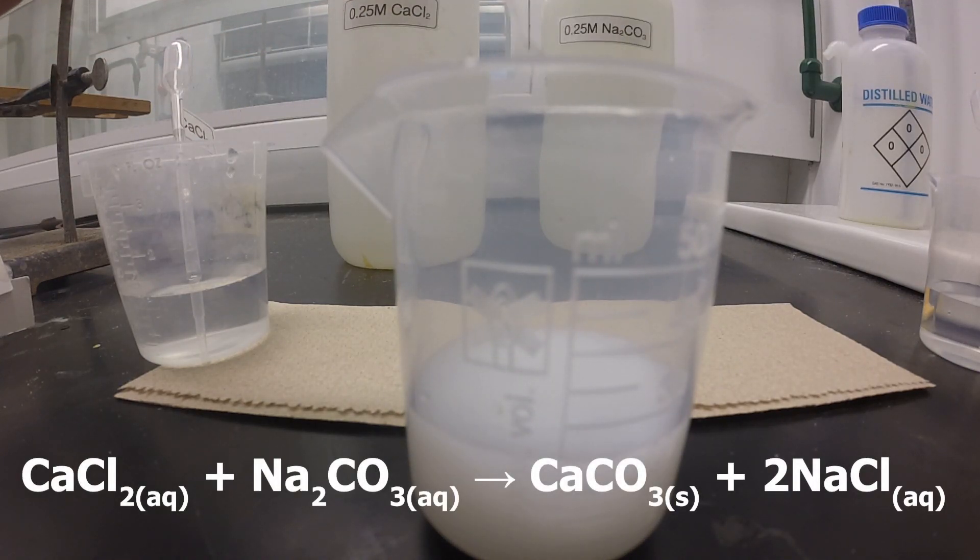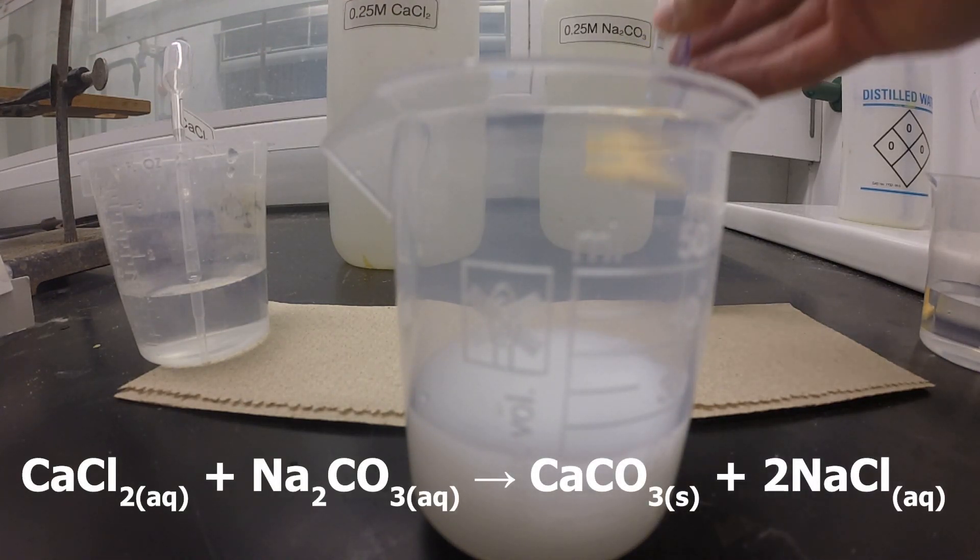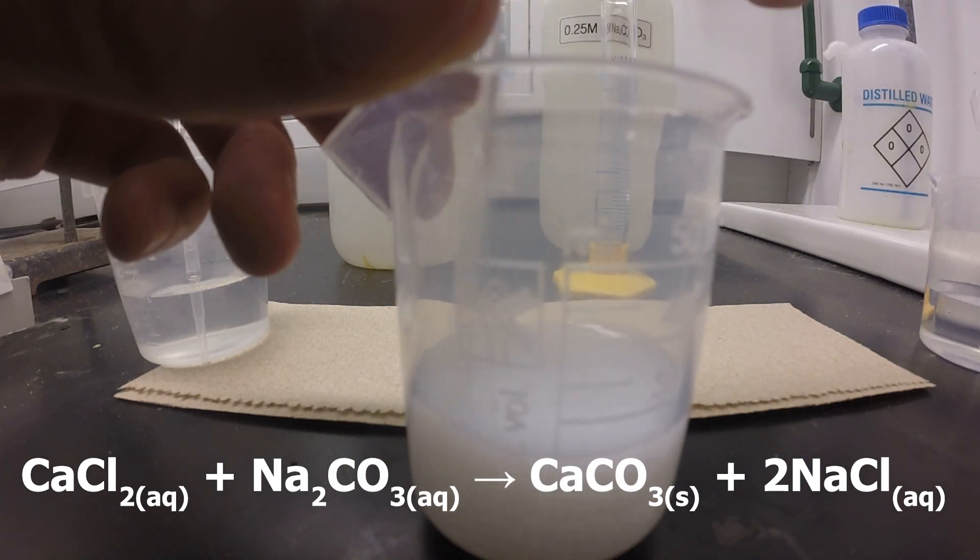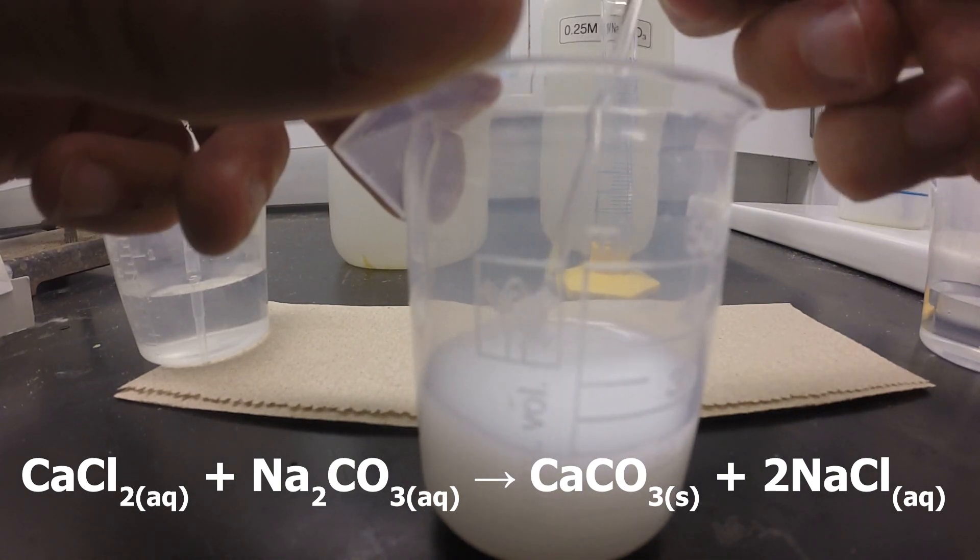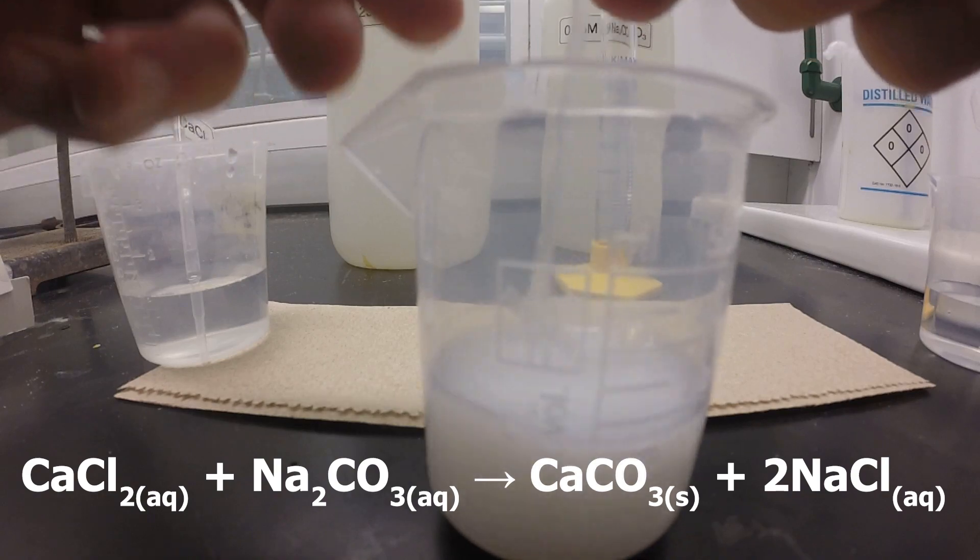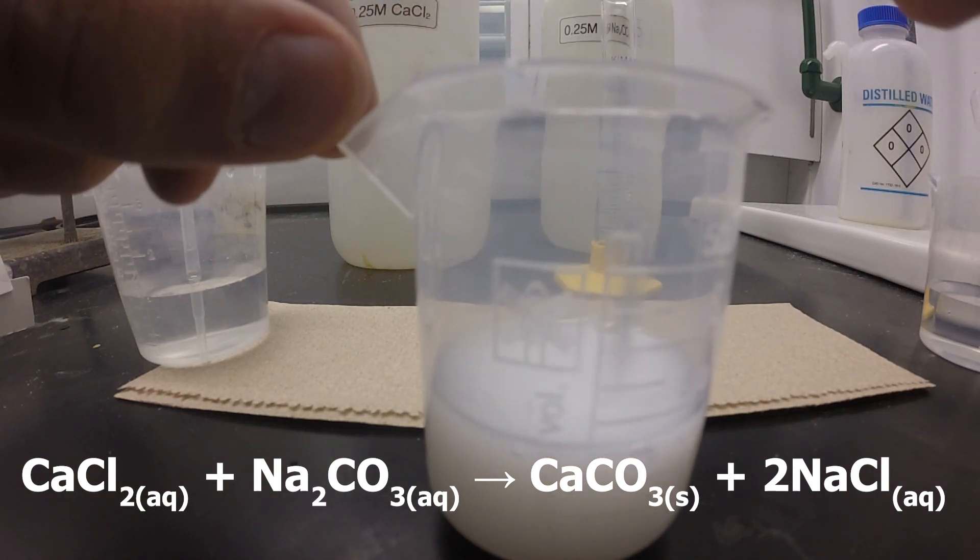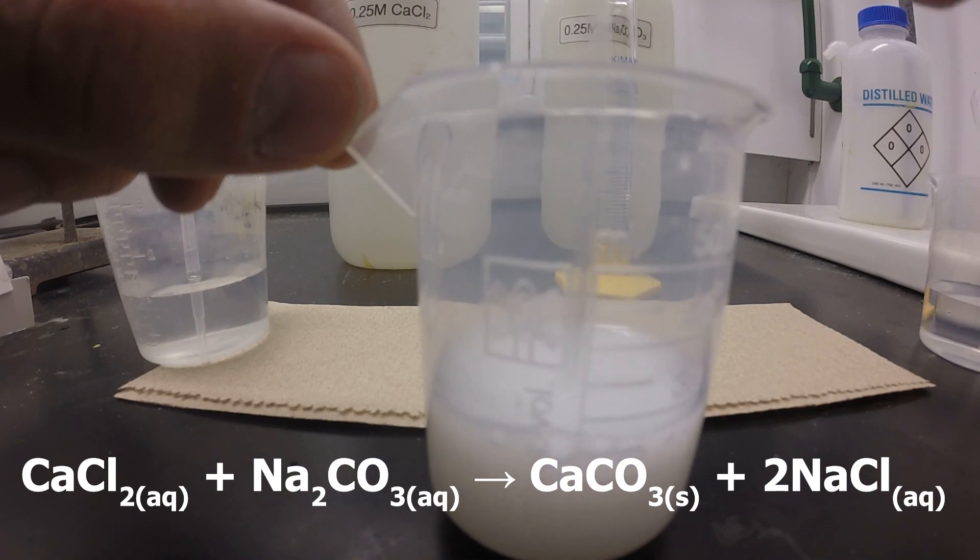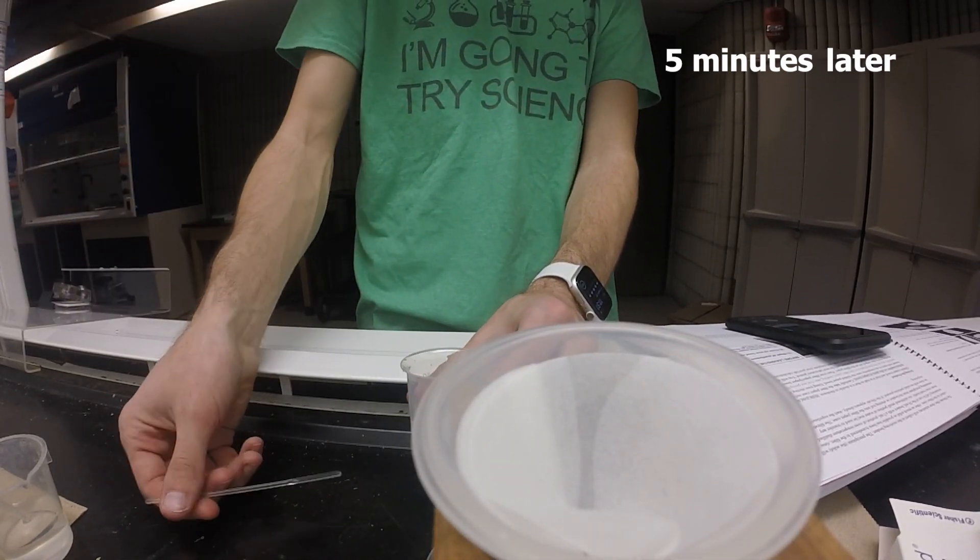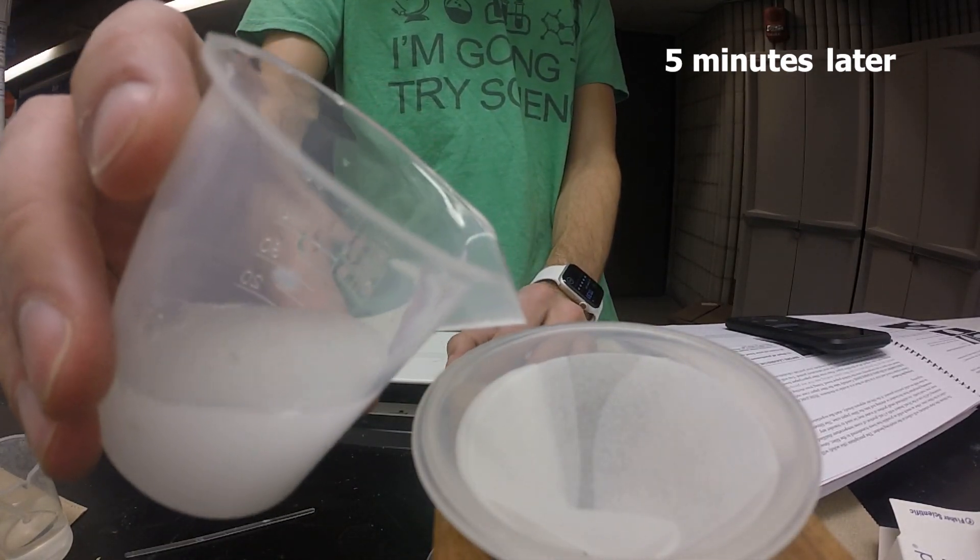You can see almost immediately we have a reaction, which you can see now below. As a reminder, the calcium chloride reacted with the sodium carbonate. We formed calcium carbonate, which is a solid according to our solubility rules, and sodium chloride, which is aqueous according to our solubility rules. We're going to stir for about five minutes, or because of editing, real quick for you guys. Then we're going to pour it off onto our filter paper.